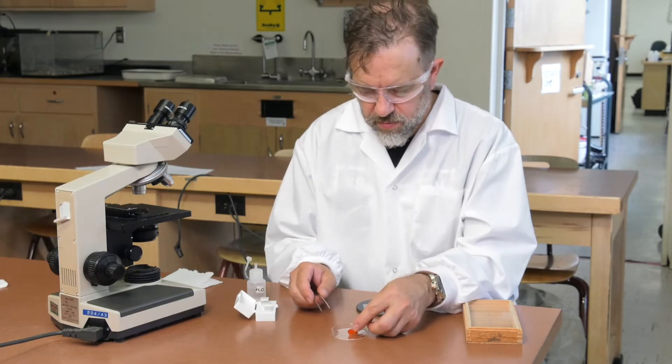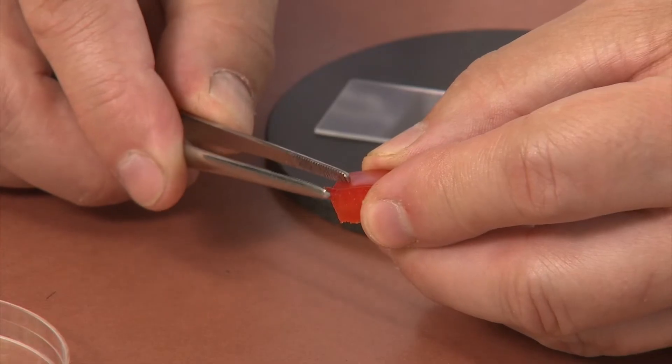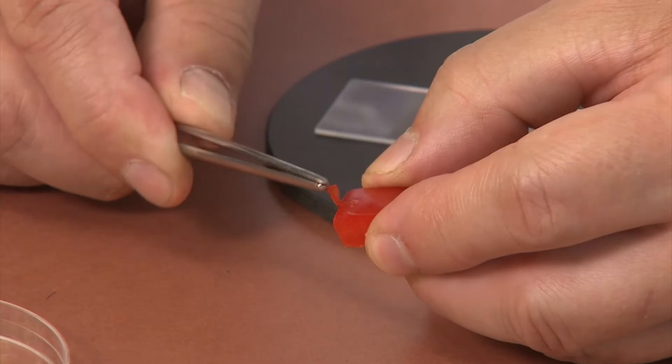Pick up a piece of red pepper and use the fine forceps to peel the skin from the outer surface of the pepper.